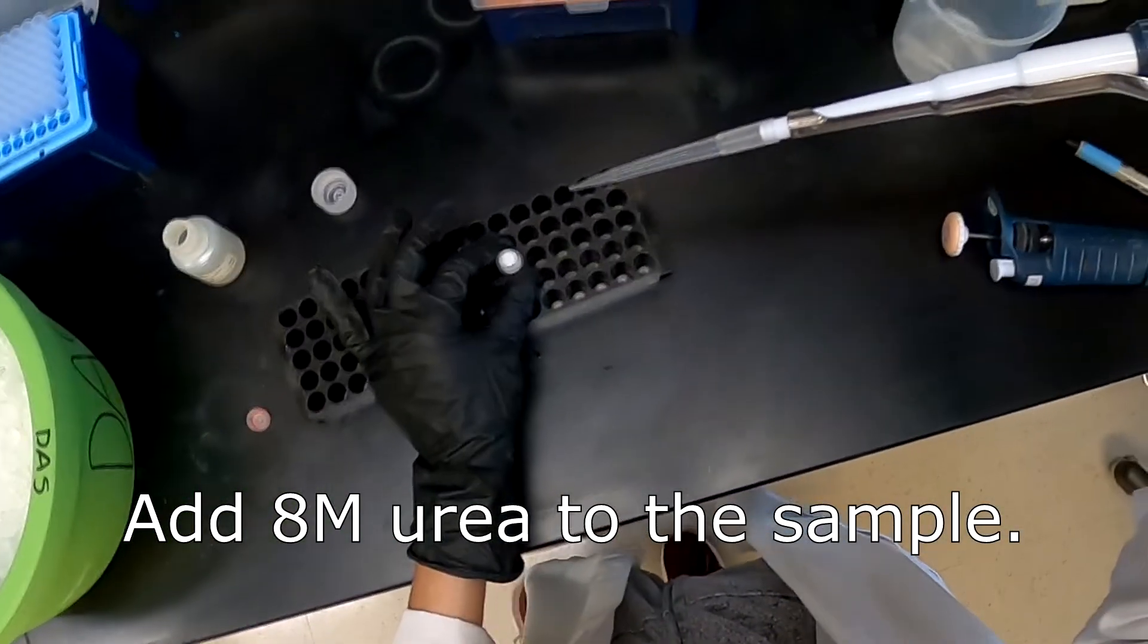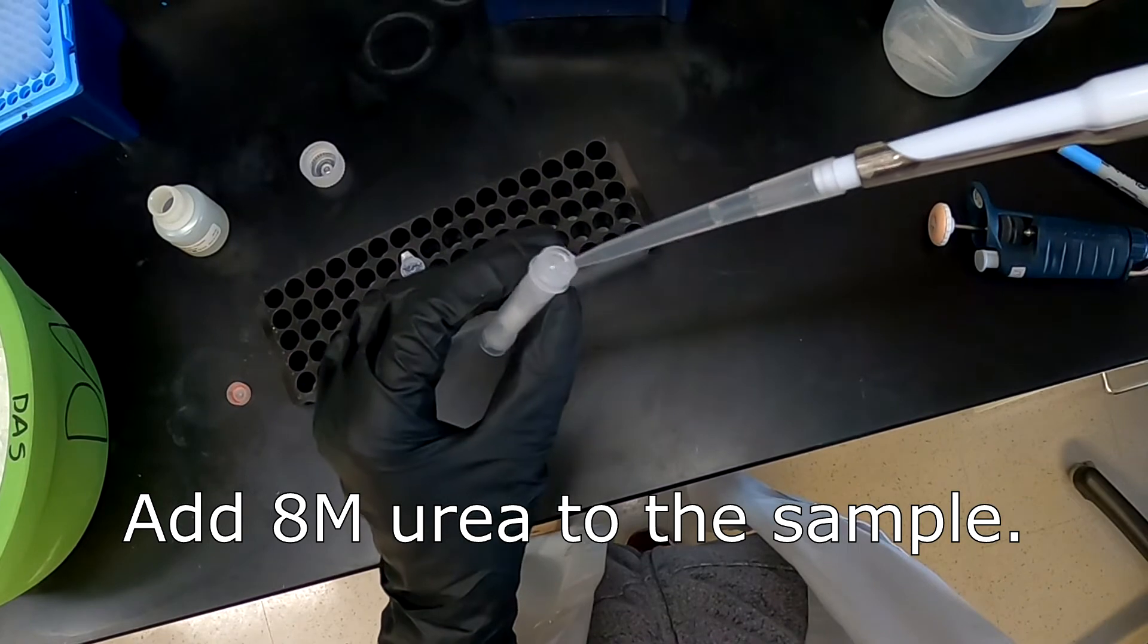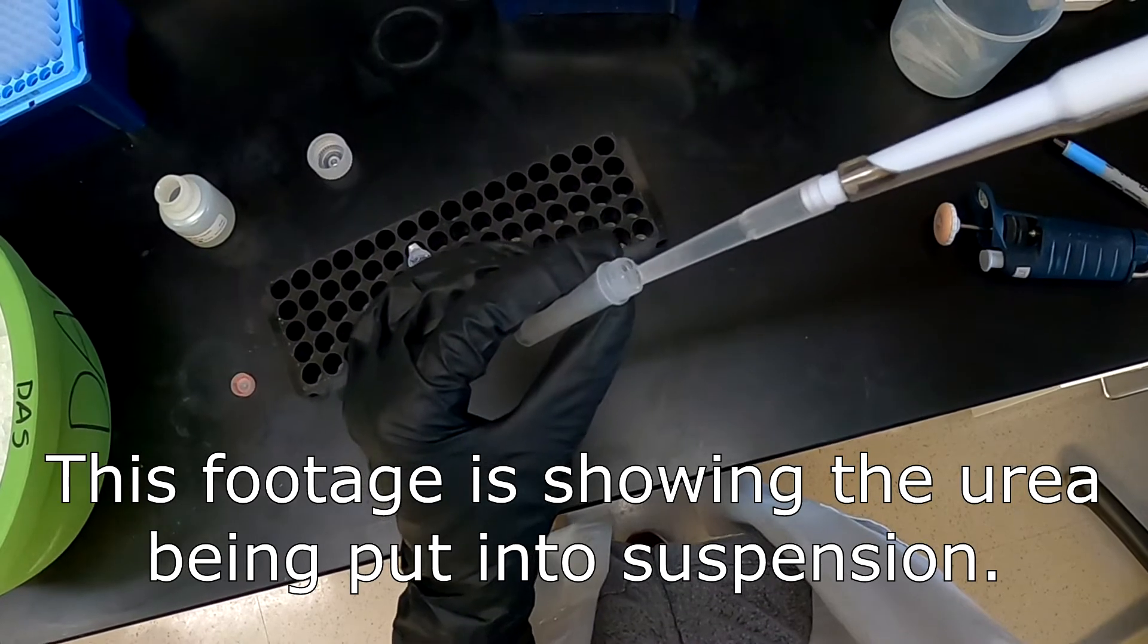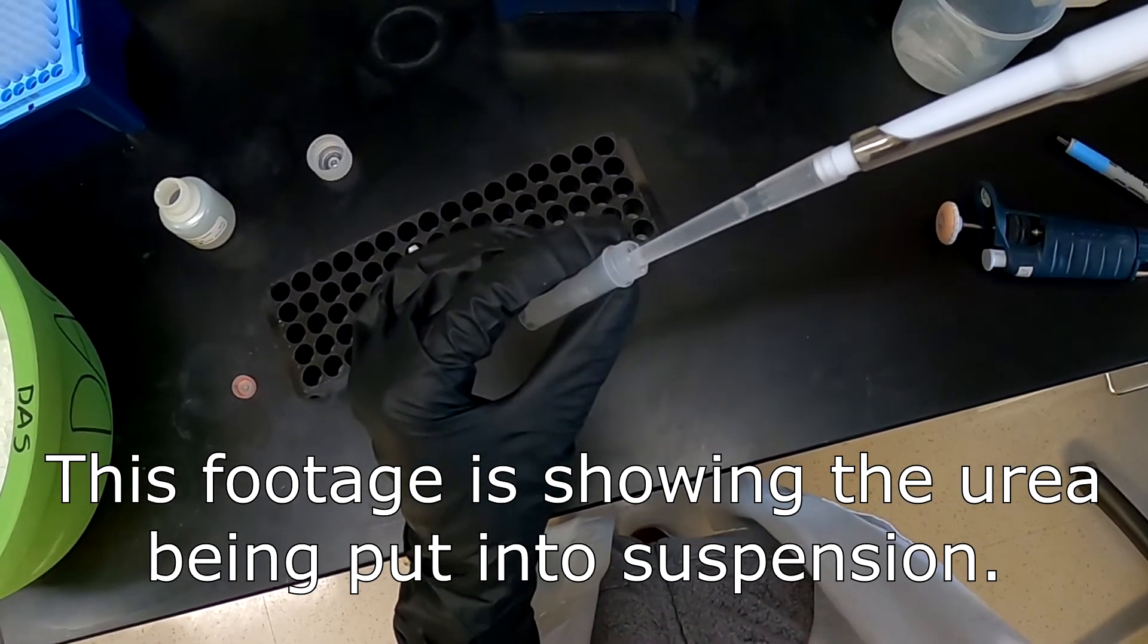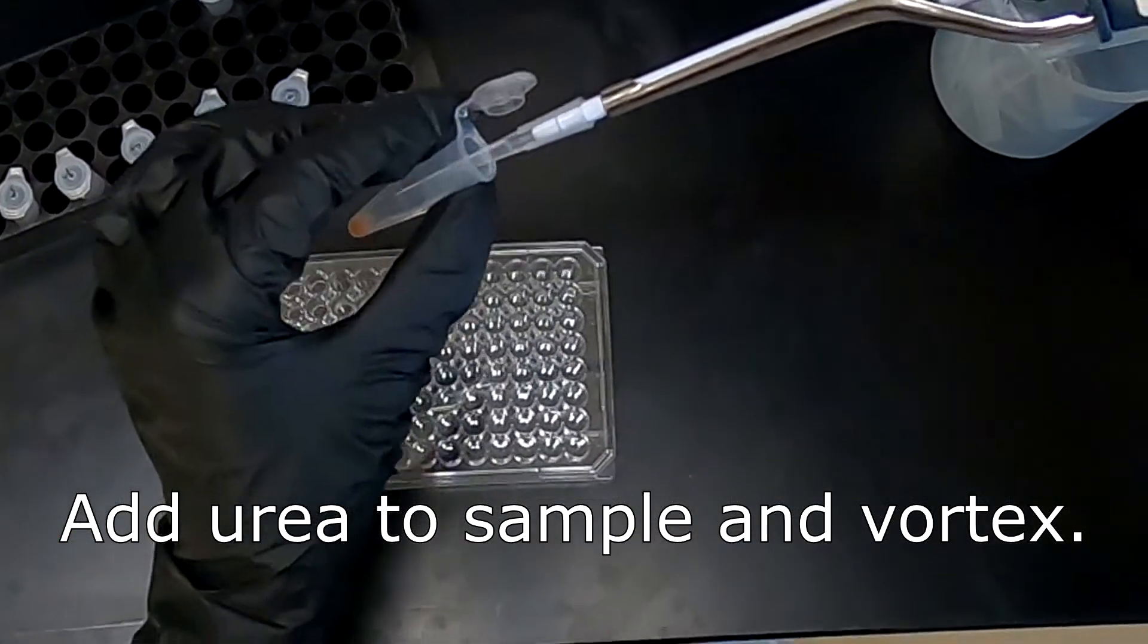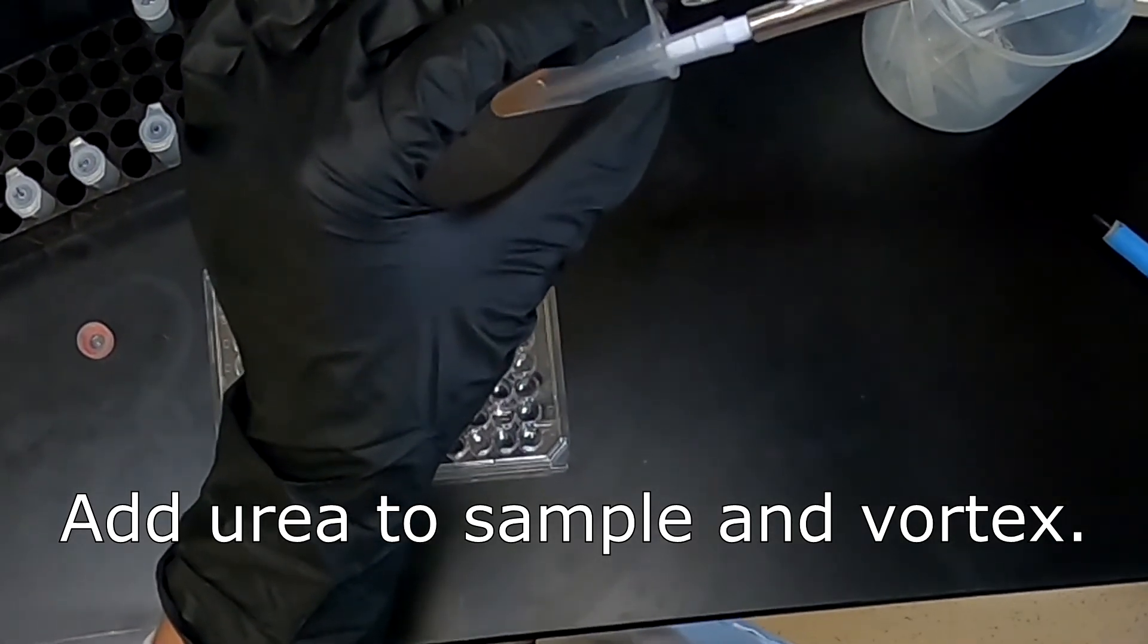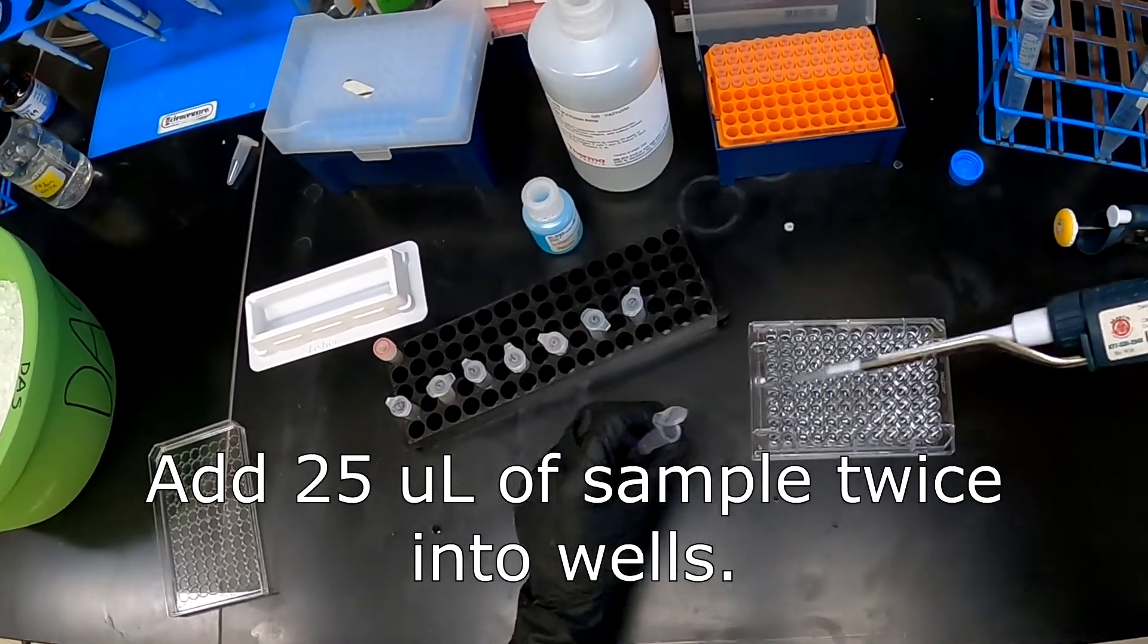The yeast sample from last class will be resuspended in 100 microliters of 8 molar urea. This will allow for the sample to be lysed in order for the internal proteins to be released. The sample was then vortexed for 2 minutes. After this, the sample was diluted 8 times using water. That way, the urea would not be at a high enough concentration to interfere with the BCA. After this, 25 microliters of the sample was then added to the plate.